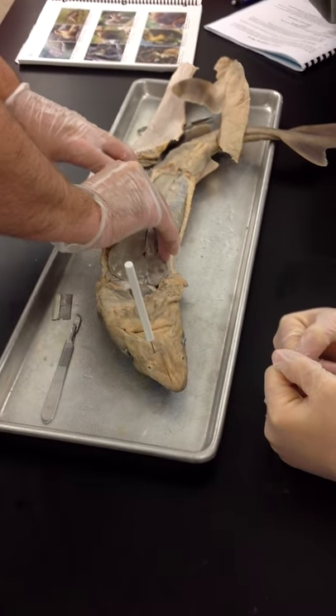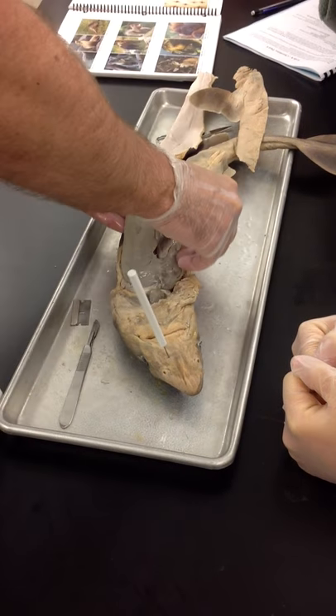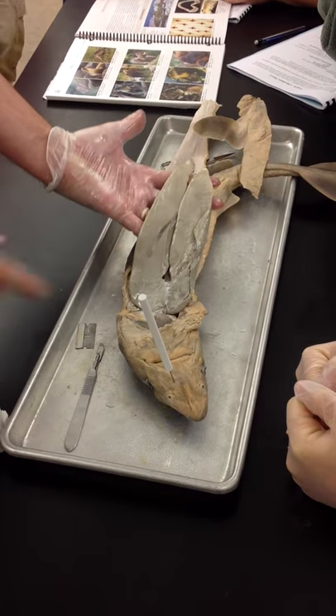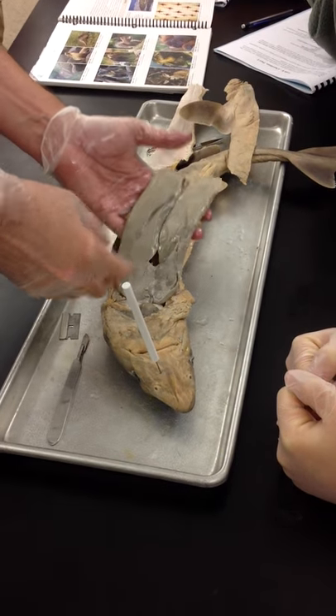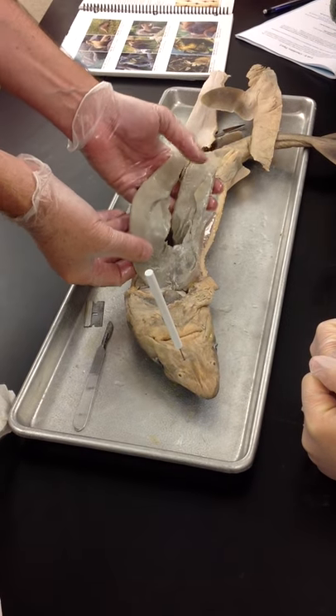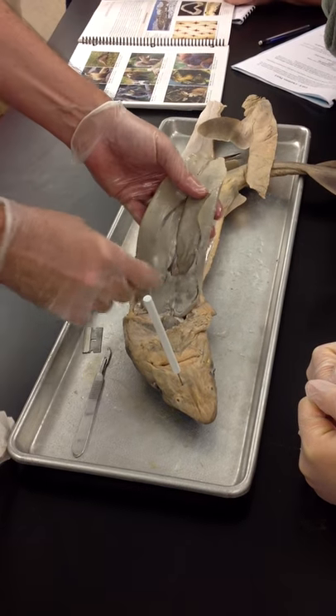So, the first and most obvious structure, which is extremely large with three major lobes — this is the liver. Very large liver. In fact, in most animals, the liver is one of the largest organs inside the body cavity.